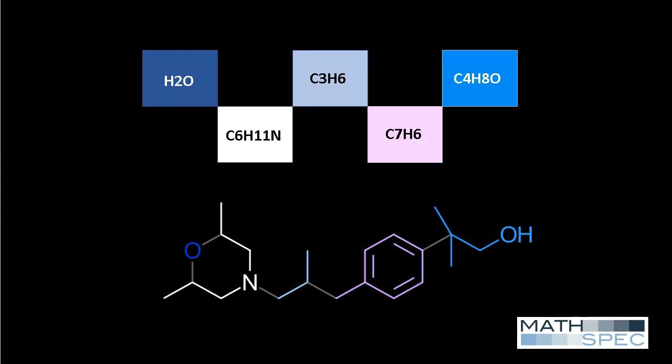The actual molecular structure shown is in the mind's eye. We're seeing C7H6. Now we can imagine, based on the structure of fenpropimorph, that the other substructures have not changed, but we don't know that from the mass spectral data. So this approach assumes that the simplest explanation of the data is the most likely explanation.